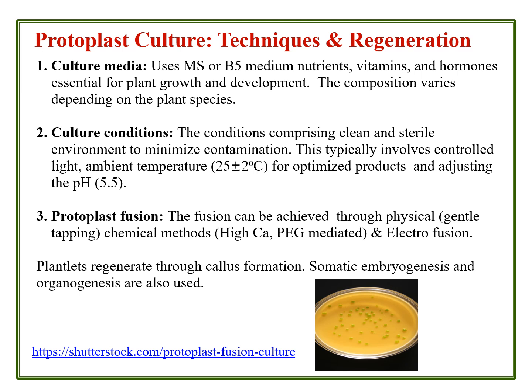The composition varies depending upon the plant species. So one species requires special conditions to sustain itself, to give more number of clones. The cultural conditions comprise a clean and sterile environment to minimize contamination. Generally 70% ethyl alcohol, surface sterilization, chemical sterilization, and physical modes of sterilization can be applied to attain cleanliness and hygiene in plant tissue culture practices.